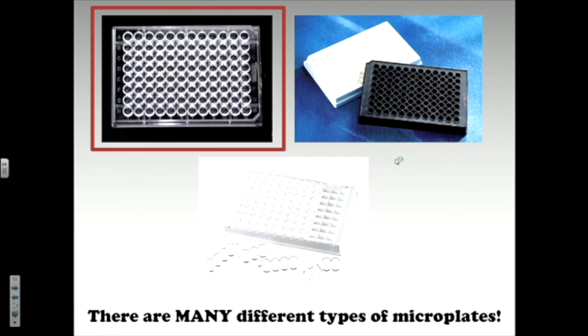So if you're in a lab and you use the wrong plate, one that's expensive when you don't need to be using one that's expensive, you're probably going to make some people cranky. So good to know what you're getting into in terms of plates.